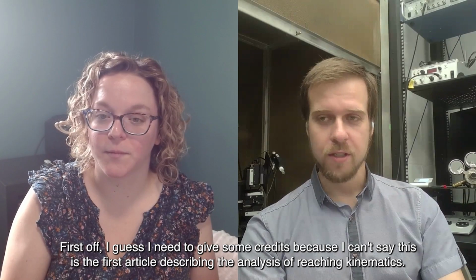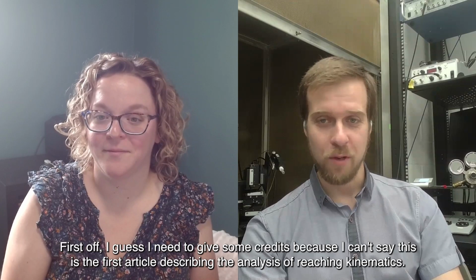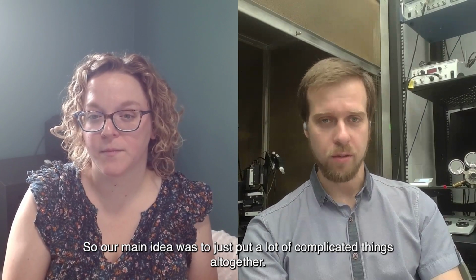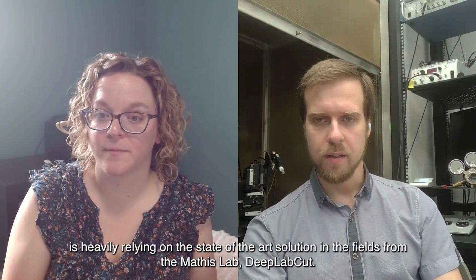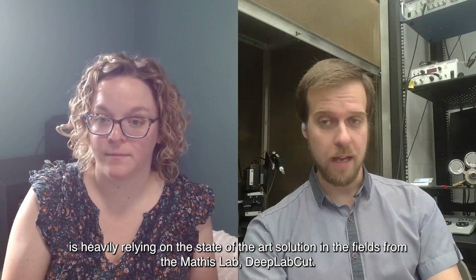Yeah, sure. First off, I need to give some credit, because I can't say this is the first article describing the analysis of reaching kinematics. Our main idea was to put a lot of complicated things all together, and the analysis part relies heavily on the state-of-the-art solution in the field from the Mathis lab, DeepLabCut.